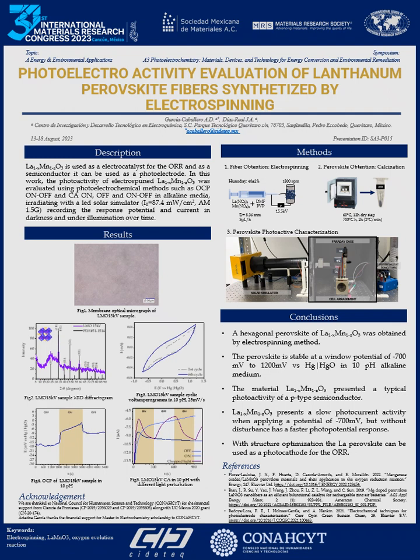Hi, I'm Ariadna Garcia, and the poster titled Photoelectroactivity Evaluation of lanthanum perovskite fibers synthesized by electrospinning is about how we evaluate the photoactivity of the perovskite and if it can be used as a photocathode to catalyze the oxygen reduction reaction. To test the material, we use simple photoelectrochemical techniques such as open circuit potential and chronoamperometry to evaluate the photopotential response and the photocurrent response through time in darkness and under illumination.